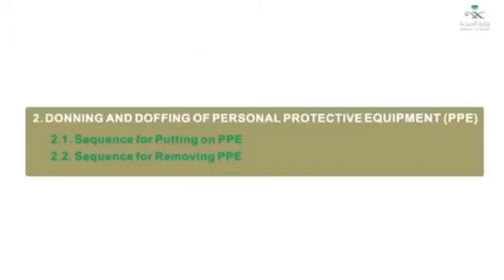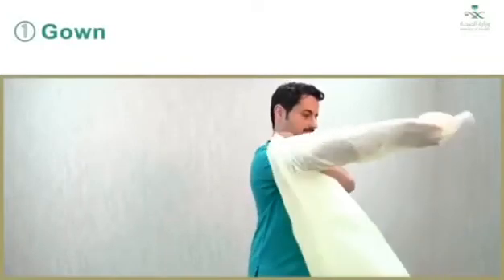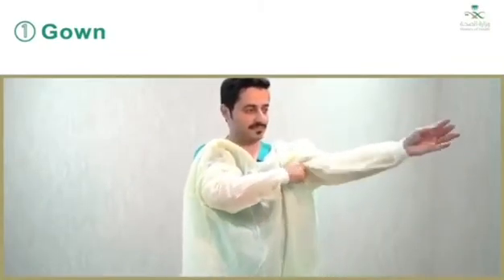Donning and doffing of personal protective equipment, or PPE. First, sequence for putting on PPE. 1. Gown. Fully cover torso from neck to knees, arms to end of wrists, and wrap around the back. Fasten in back of neck and waist.